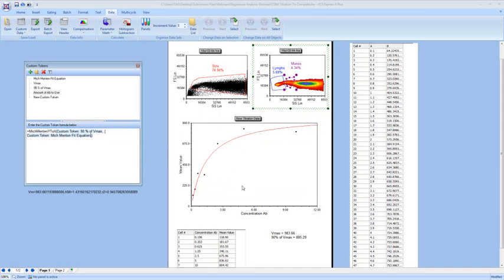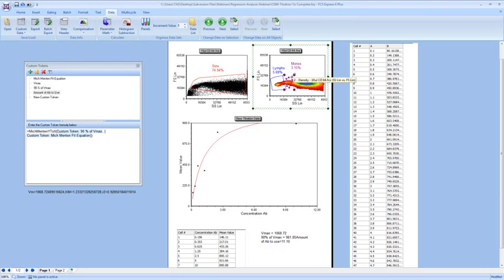And now we have our new amount of antibody to use custom token, and let's put it in our text box. We can say amount of antibody to use equals, let's make this text box a little bit larger now. And now you can see that as we move our scatter plot or update our plot here, all these values are going to update in real time, right?